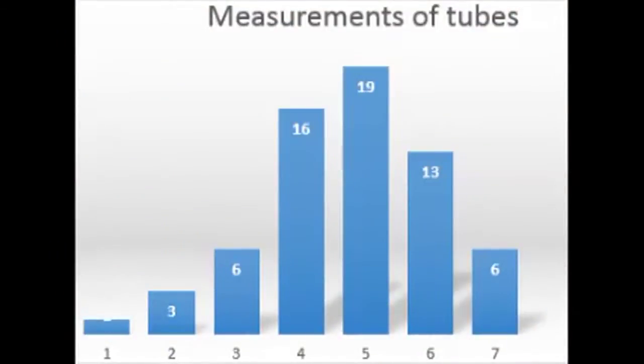Our results indicated that test tube 1 measured 1 millimeter, test tube 2 measured 3 millimeters, 3 measured 6 millimeters, 4 measured 16 millimeters, test tube 5 measured 19 millimeters, test tube 6 measured 13 millimeters, and the last one, 7, measured 6 millimeters.